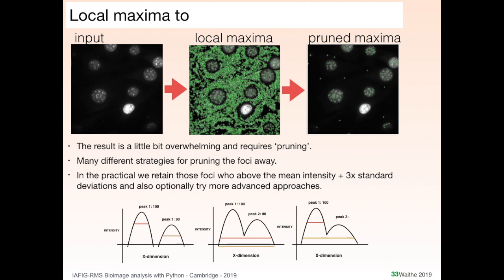Well, what's good about this is because you don't need to choose a global maxima, it's possible to separate the foci much more discreetly, because it's really just looking for that one pixel which is the peak. So you can do a global threshold, but then you're going to have to choose a value which gets all of your foci, and you'll find quite a few of them just merged together. So this just allows you to be a bit more precise in what you're looking for. But yeah, that's a reasonable strategy, and it may in some cases be absolutely fine. But we found, especially for looking at DNA, probes that highlight DNA, that this approach was much more effective.